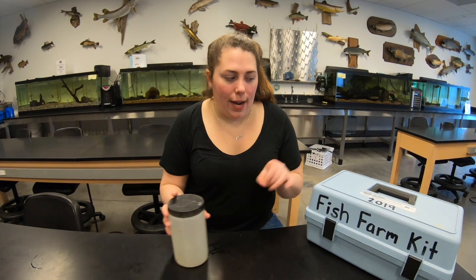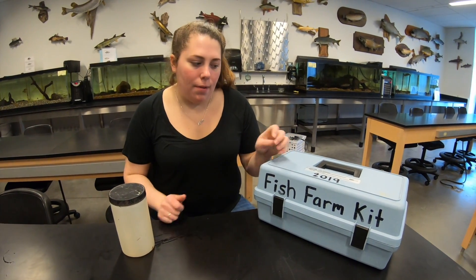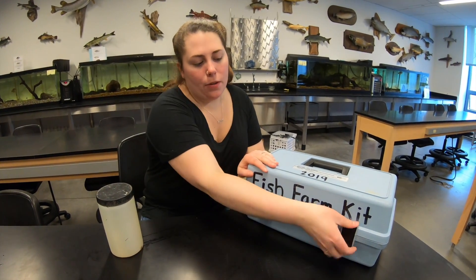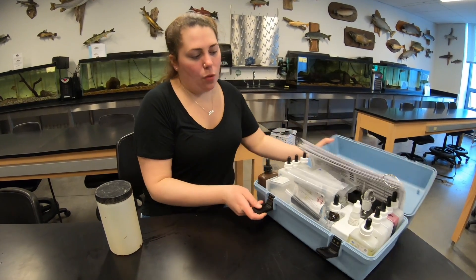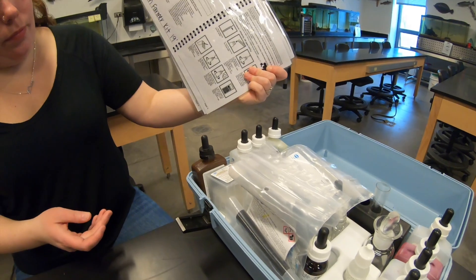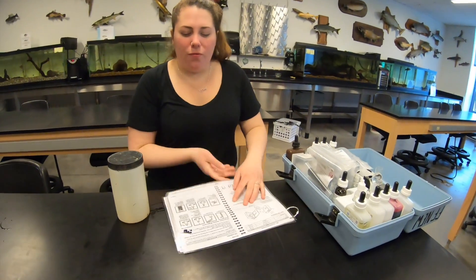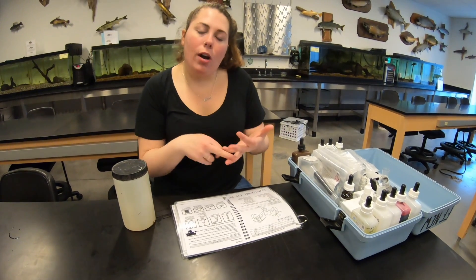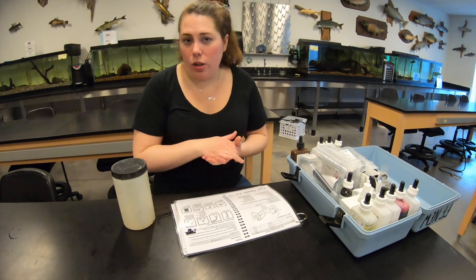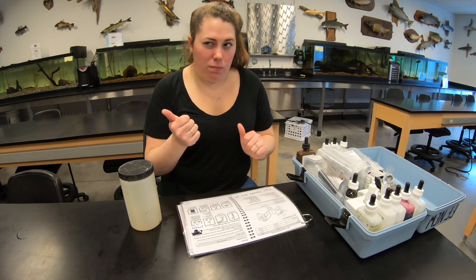Here we have our Fish Farmer test kit. It has a bunch of chemicals and directions on how to run tests to understand what's going on with the water. Typically we test alkalinity, hardness, and ammonia. We're also going to look at turbidity, but that is not part of this kit - we'll show that in a little bit.